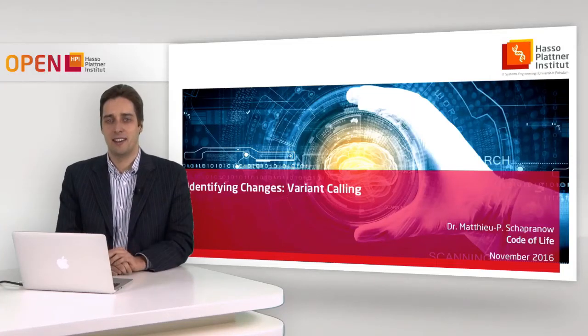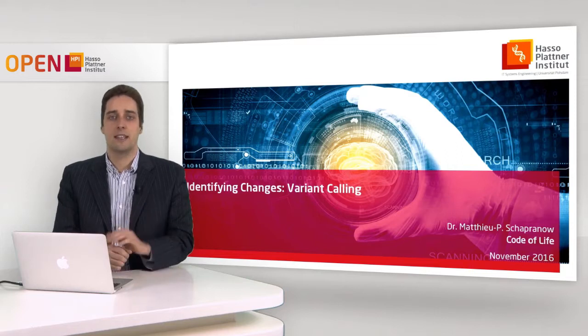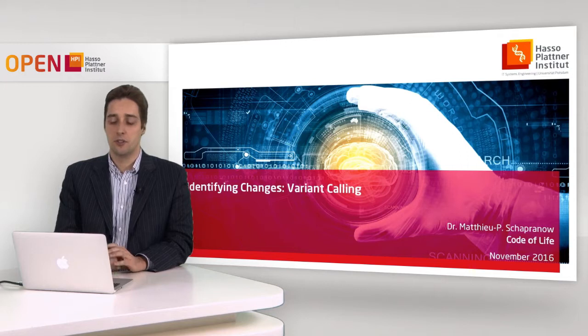Great to see you back here at the Code of Life lecture. Today we want to talk about identifying changes, or the so-called variant calling phase in the reconstruction of the genome.